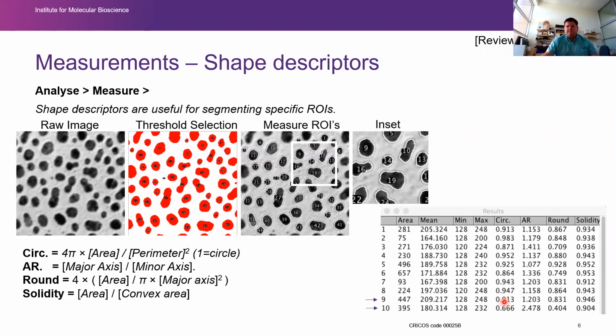You could imagine if you were analyzing bacteria and they were rod or coccus shaped, you could easily segment them based on that. Or if you've got nuclei in the tissue and you're getting some autofluorescent blobs that aren't round, you could filter based on the shape descriptor output. I've put in here what the calculations are if you are interested, but most people just use the circularity measurement.